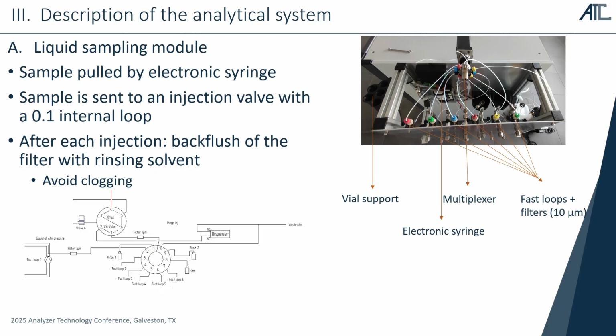The system automatically makes a backflush of the filters with rinsing solvent after each sample. This allows automatic cleaning of the system to avoid contamination, clogging effect, or memory effect when we switch between different samples.